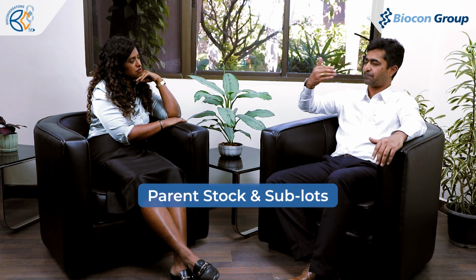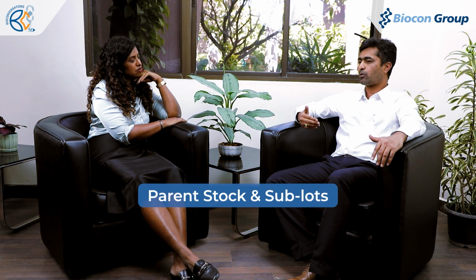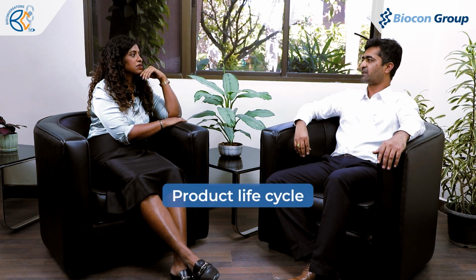So essentially for regular manufacturing batches, every time we go to the working reserve. So in this way, whenever the WCB gets exhausted, you always have an MCB to go back to, the parent stock, and prepare sublots. So in this way, we preserve the cells continuously for the manufacturing batches across several years, or the life cycle of the drug.